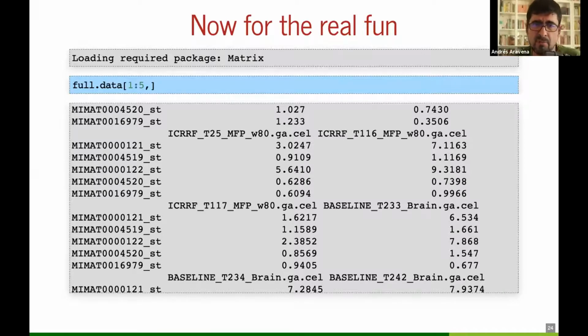One of the problems with the previous analysis is that we arbitrarily chose ad libitum as a reference. This baseline makes more sense. You have, at the beginning of time, before the diet intervention, you measure everything, and then you compare baseline versus ad libitum, baseline versus calorie restriction, at different times, and so on.